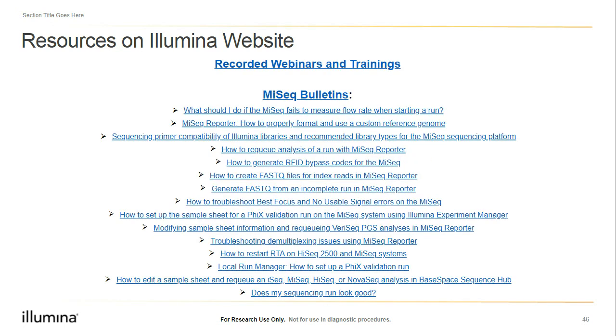I have a link here to the recorded webinars and trainings page, which contains a ton of relevant classes and information, as well as the MiSeq support bulletins page. We've also listed a bunch of resources here for the MiSeq, or resources which are relevant to runs performed on the MiSeq. Please note they might not all seem MiSeq specific, but I can guarantee you they will have information that you'll find valuable if you're running the instrument regularly.